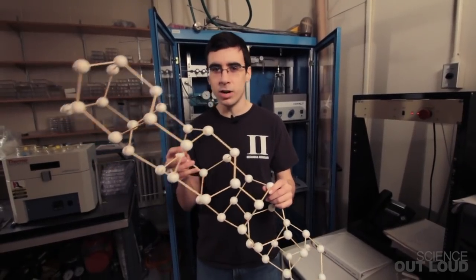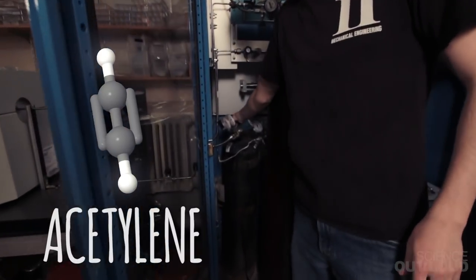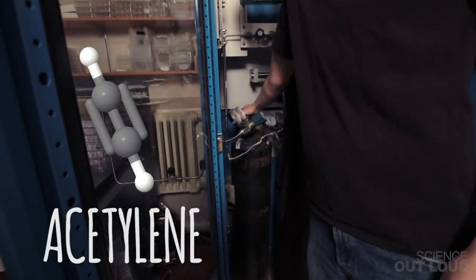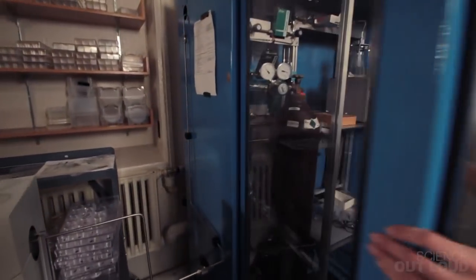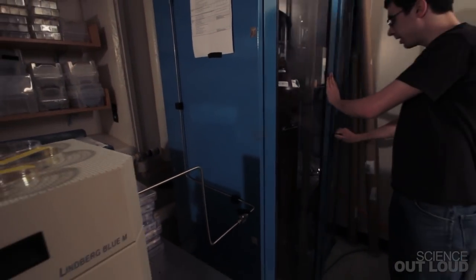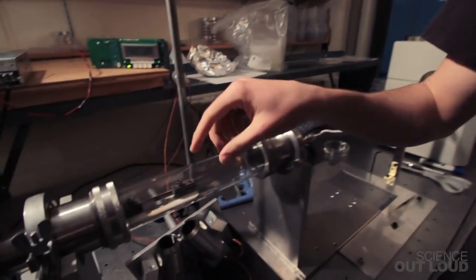So where are we going to get all of this carbon? It's going to start out in this tank of acetylene. Acetylene is a carbon-rich gas, and once I open it up it's going to start flowing through these tubes and continue on through this pipe where it will eventually end up in this growth chamber.